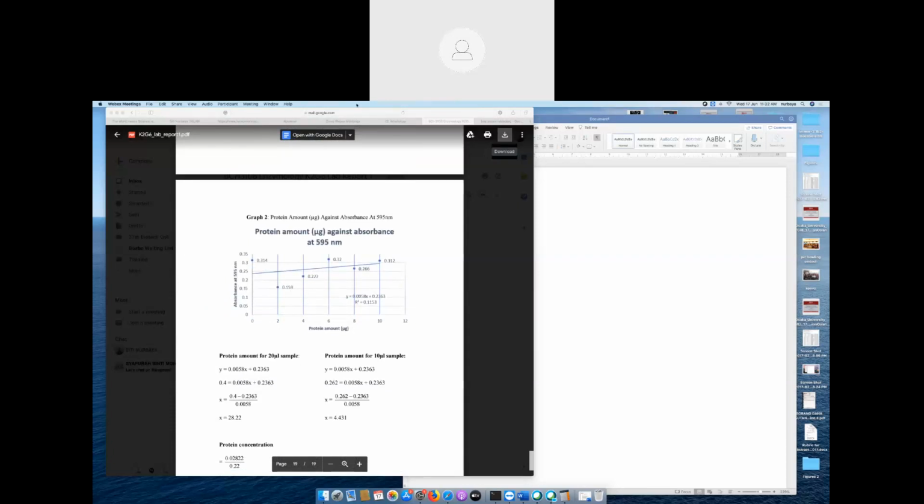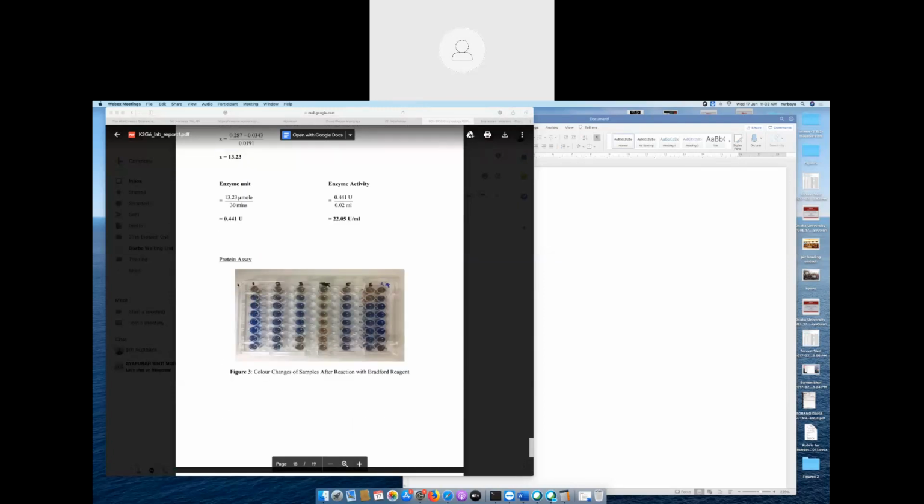Logically, you have put the first well with 0 volume, 0 amount of the protein, meaning that this well number 1 is for your blank. How come blank gives you some absorbance? Because it is meant to be zero. Blank means you read zero, you make it zero.